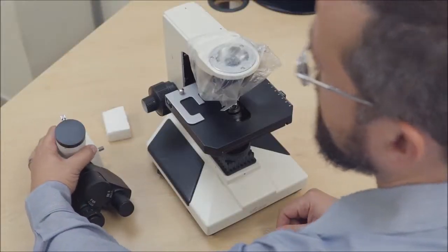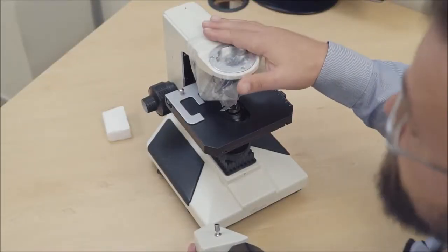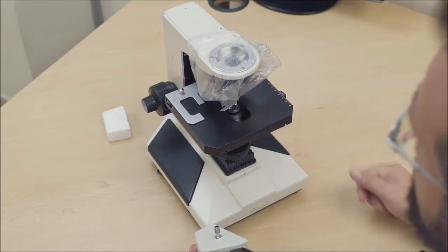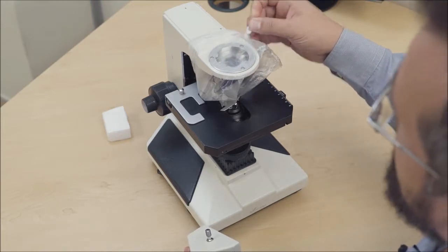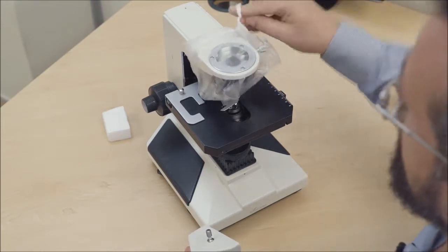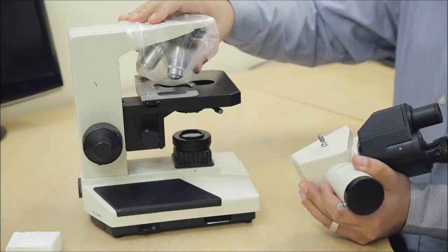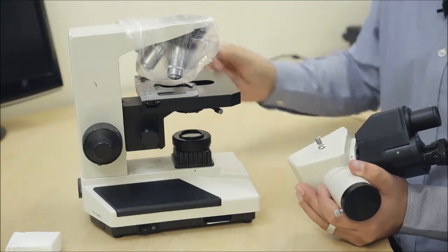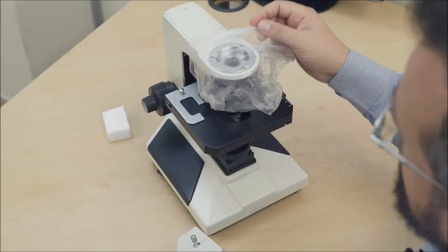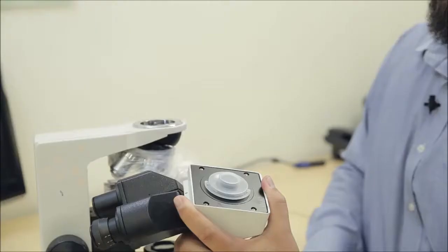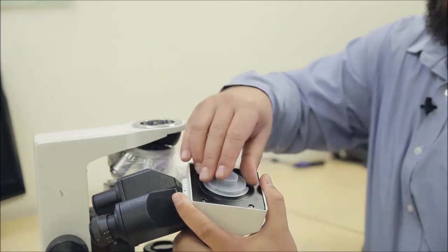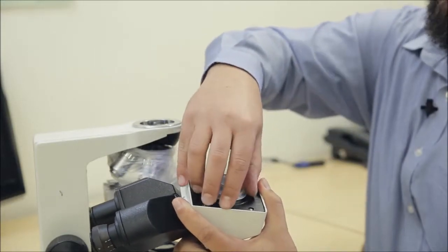Then we're going to attach the trinocular head onto the microscope body. So firstly we'll remove the protective plastic from the top of the microscope body. This simply just slips off and it really is just to protect the objective lenses from any dust getting into the system. So we'll remove that, and there's a protective plastic cap at the base of the trinocular head that we also need to remove.